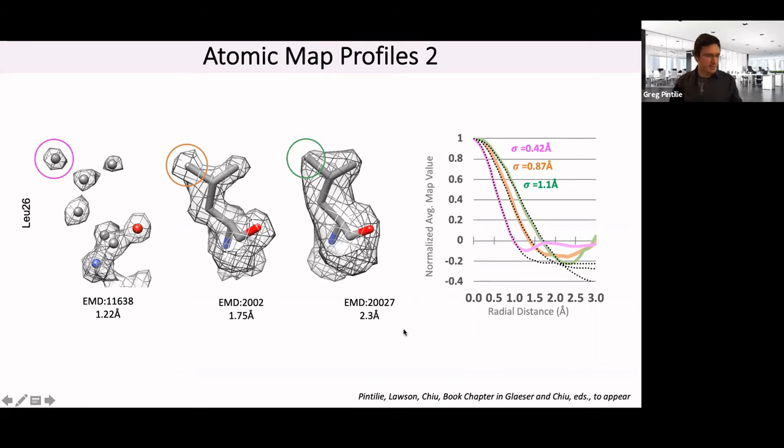And then somebody asked the question, well, what if the atomic profiles are not Gaussian? It was a very good question. If you're trying to fit a Gaussian to a curve that doesn't look Gaussian, you tend to get random or unexpected results. So that wouldn't work too well in those cases. And as I'll show a little bit as we go on, not all atoms have these nice drop-offs or Gaussian-like profiles. They only have them if they're well resolved. And if it's not well resolved, then what you get is unexpected.